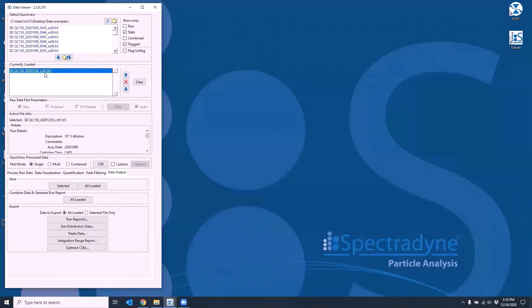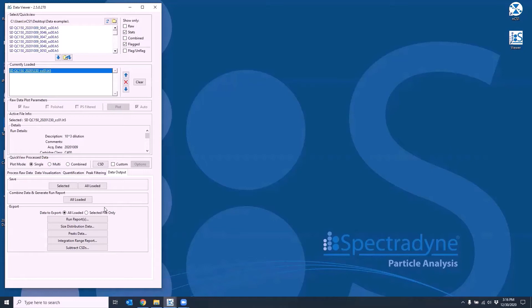Now let's take a look at the export options. The run report option allows you to create the Excel run report format without having to combine the data again.